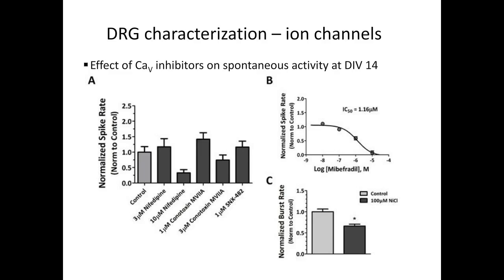selective toxin, peptide, conotoxin M7A, and you can see here that at 1 micromolar and 3 micromolar, there was not much of an effect with N-type, and the same thing with the R-type, the SNX482 peptide. Again, you can see there's not much of an effect with these compounds. So the 10 micromolar effect with nifedipine could potentially be due to effects on T-type calcium channels, because at these higher concentrations, nifedipine does have an effect on T-type calcium channels.